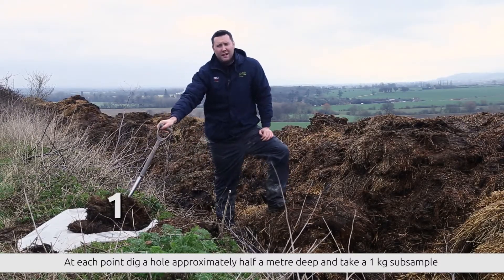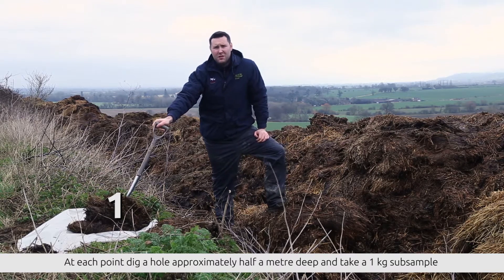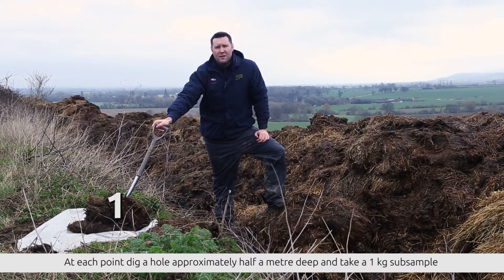The other nine samples we will collect later will then be mixed on this sheet to give a representation of what is actually in the heap itself.